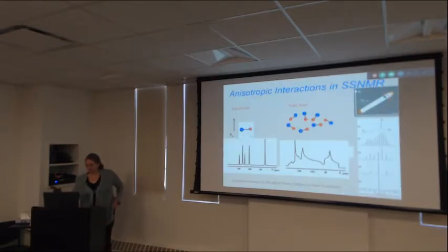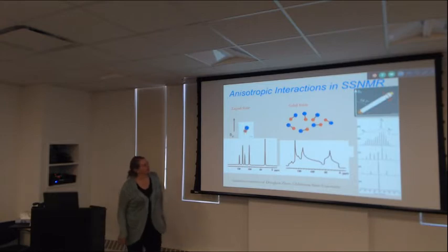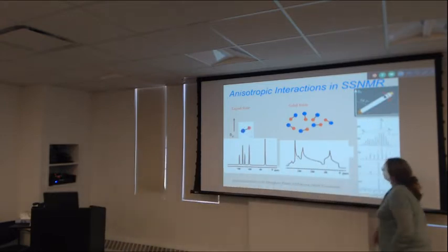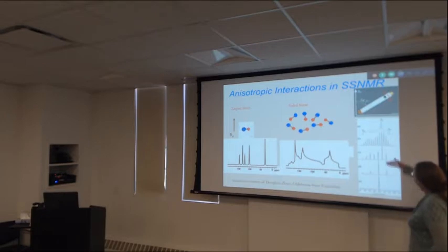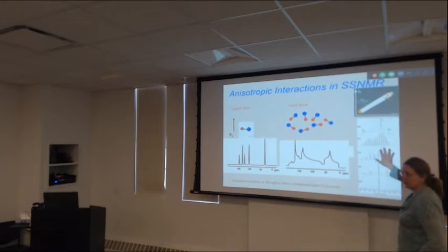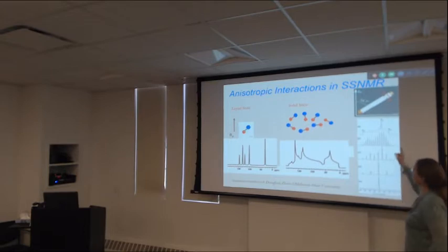Another cartoon displaying the same thing, lovely animation from Donghua. So, in the liquid, you ask the molecule to do the tumbling, in solid state, the rotor does it. We should draw a little molecule inside the rotor to make the idea completely clear. And what this says that the last slide didn't say is that the frequency of spinning is important. If it's low frequency, you get a comb. From one kind of spin, you get many peaks.